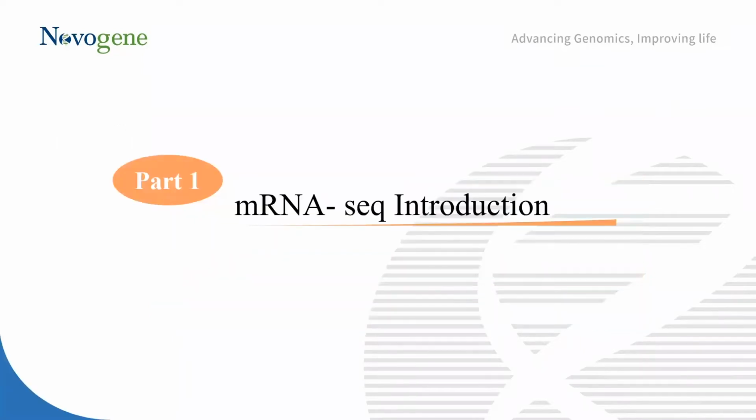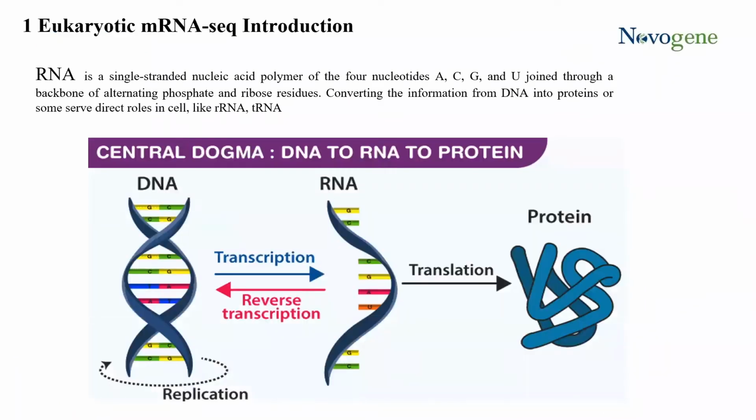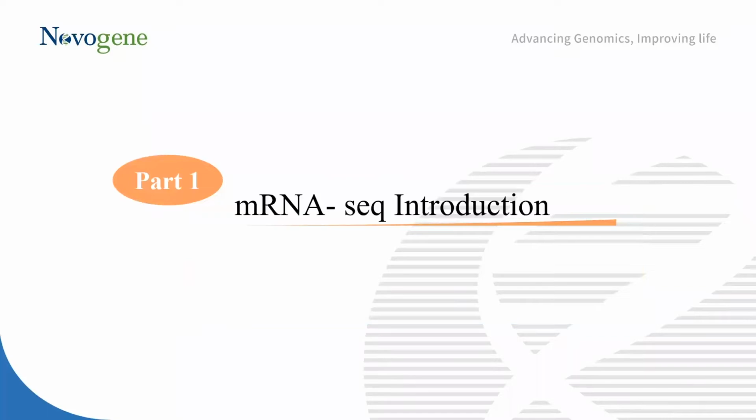In the first part, our mRNA-seq introduction, we will discuss the basics of RNA, the types of RNA, Novogene's Falcon platform, the applications of mRNA-seq surveys, and the mRNA-seq workflow at Novogene.